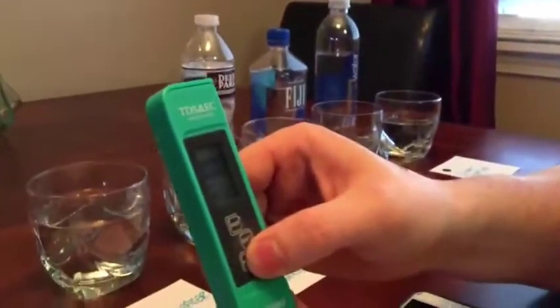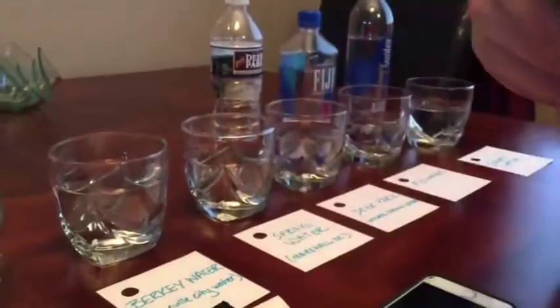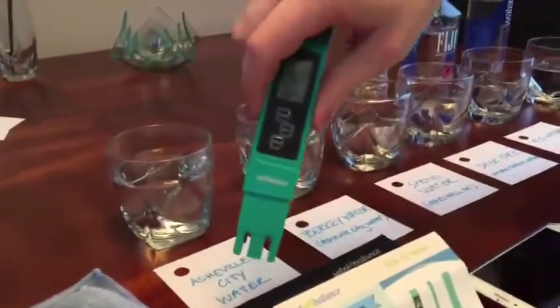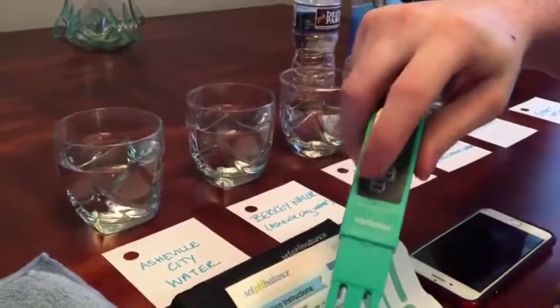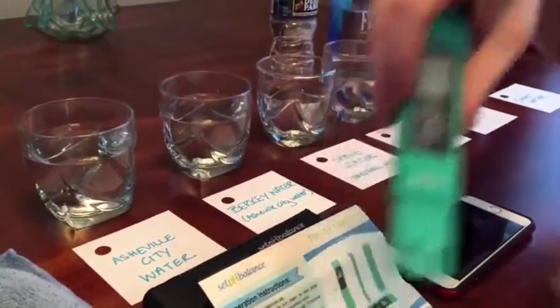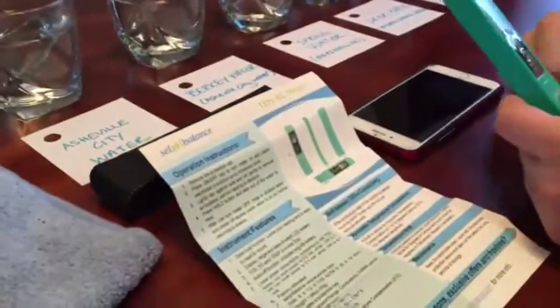So when you're measuring it, the hold button here, you can see it. You get your reading and you can push hold, and it will hold the reading for you and won't go away when you pull it out. Just in case for some reason you're trying to reach down in a barrel or something you're just trying to measure. Maybe you have a well and if you're doing your measurement, then once you believe you got it, you can hit hold, pull it out. Now you can tell what you had. So that's always a very nifty tool to have on.